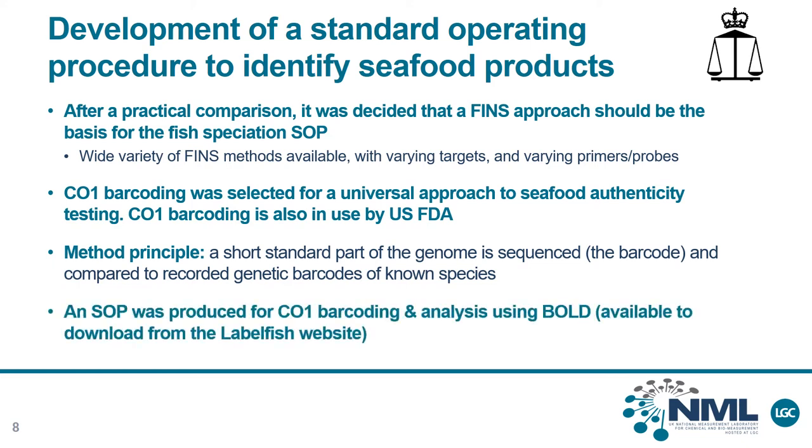The SOP, developed as part of the project, utilizes BOLD, the Barcode of Life database, and is available to download from the Labelfish website.